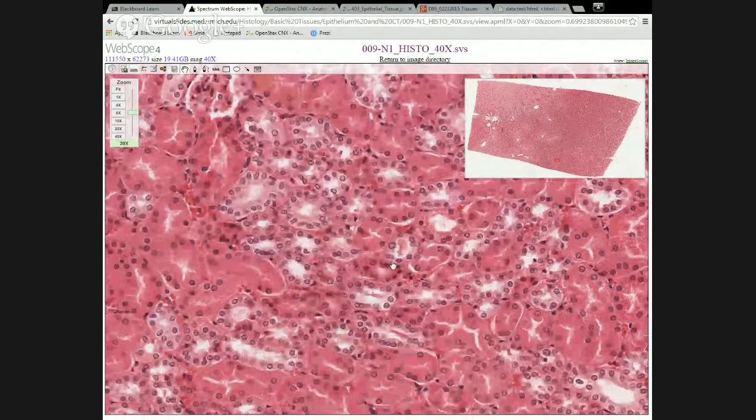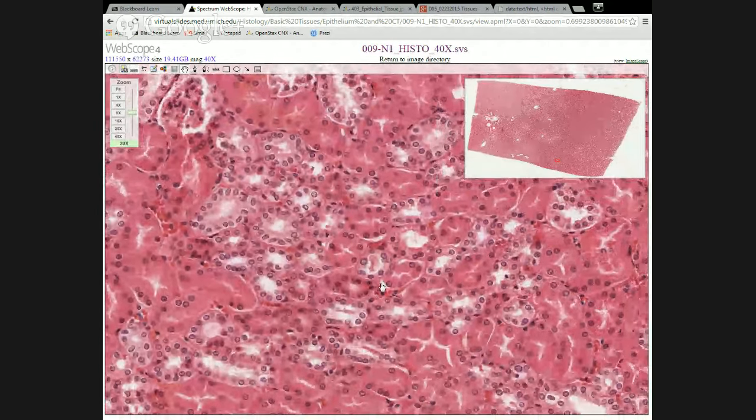So here's a little region with a number of pretty good little lightly stained, well-defined epithelia. And so any of these, we can see the clear space in the middle of the tube, and the edge of the epithelia right next to that clear space, that's the apical side. And then just the opposite side of those cells, we can usually see the hint of a line kind of outlining that. That's the basal side.